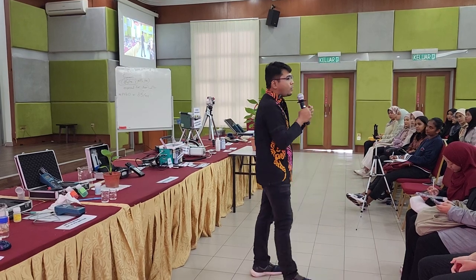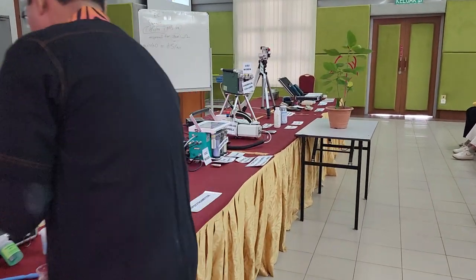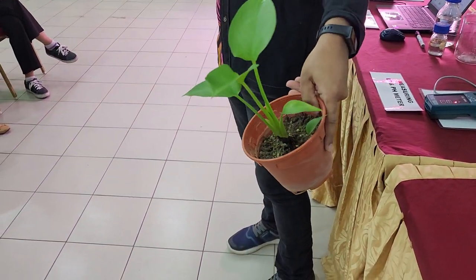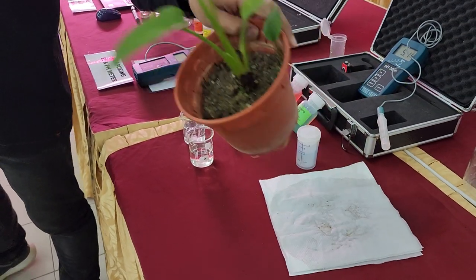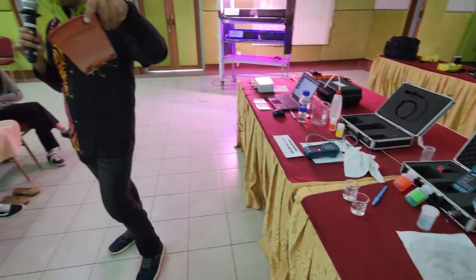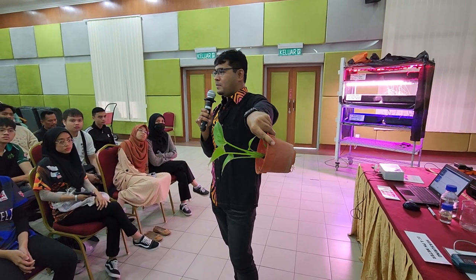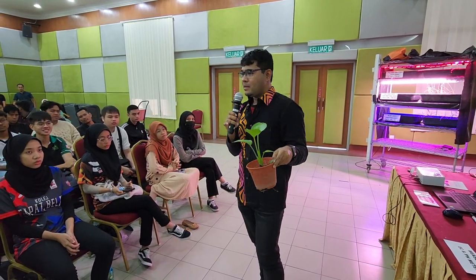Okay. So why is this important to the plant? I think we measure first. Let's see. You see this one? Before I plunge the probe into this, want to guess what the pH of this is? A good agronomist can actually have a very sharp guess about the pH of the soil. What do you think the pH is going to look like? 7? 4? 6.5? That's very safe. 5.5. Okay, 6.5, 5.5. Let's see.